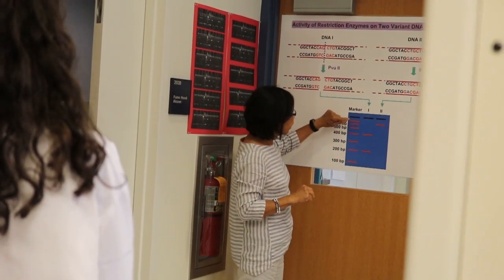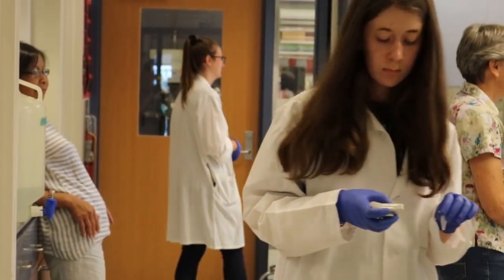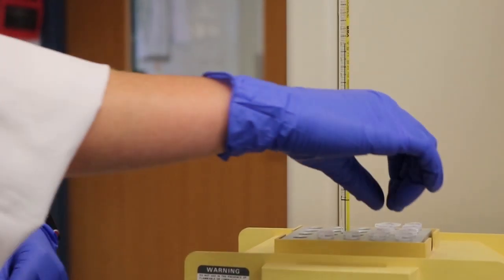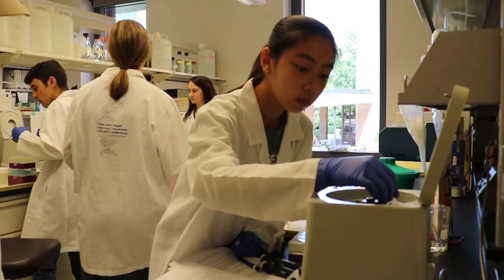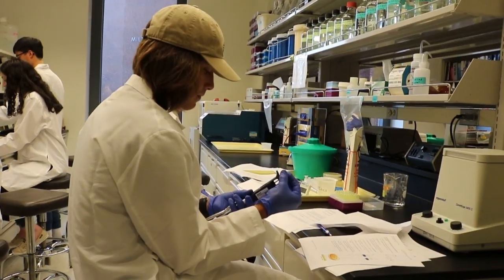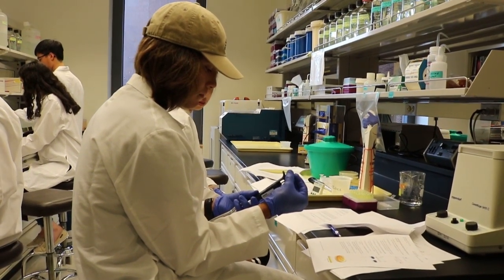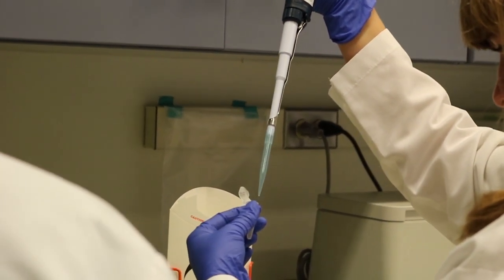I'm Dr. Lloyda Escote-Carlson. We really enjoy having the kids over and they learn a lot within the three days that they come to the university and work in the laboratory. I really want them to be interested and excited in science, particularly in biotechnology, which is making rapid developments in all areas from health to energy to agriculture.